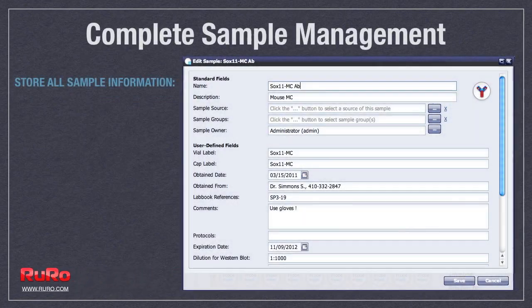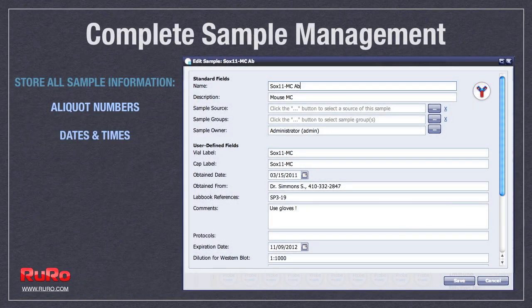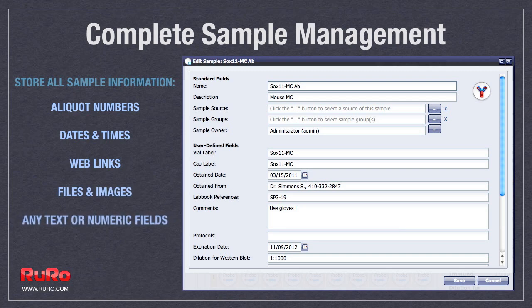Store all sample information, aliquot numbers, dates, web links, and images. Set alerts, generate reports, and much more.